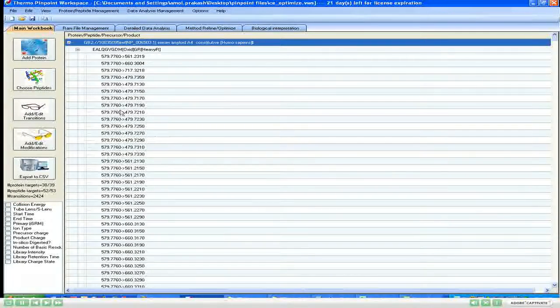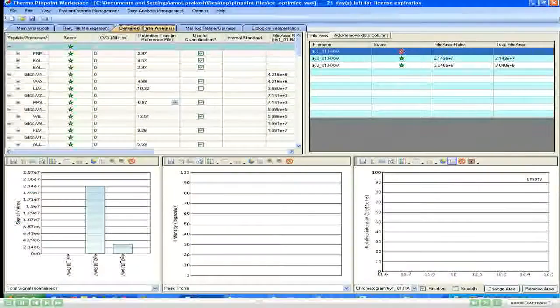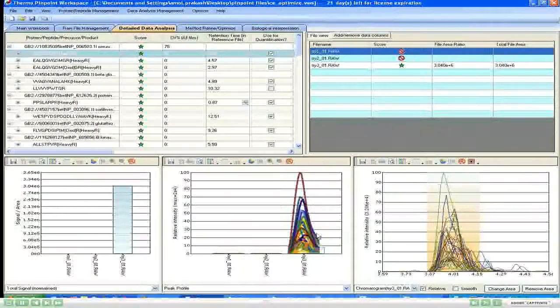So in this window, you can see we are monitoring about 30 transitions at any given time. And if we do 7 possibilities for every transition, we are monitoring approximately 210 transitions at any given time. We can choose to split this into 2 runs, and we can export this file to CSV. And I wanted to show you how this file looks. I'll call it CE_run, and it has generated 2 files, and we'll go and find those.